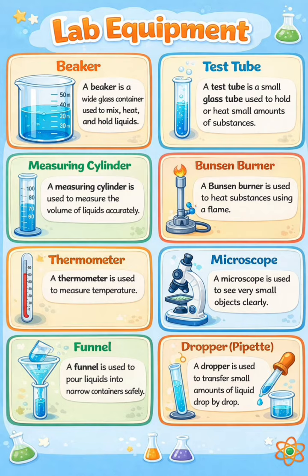So, you remember the keywords: mix, heat, and hold liquids. And a beaker is a glass container, not other materials.